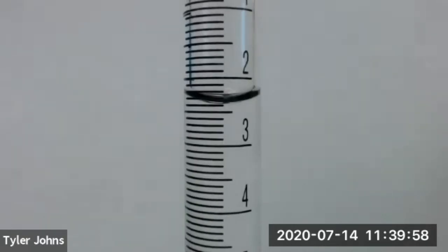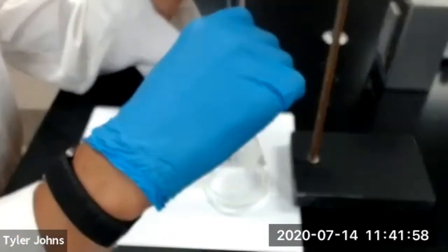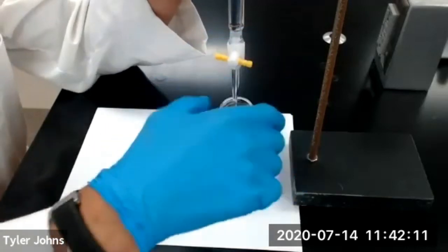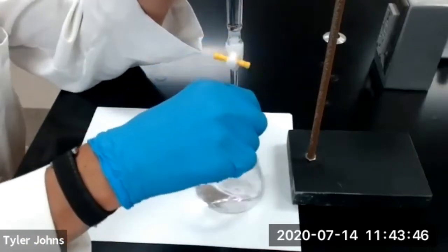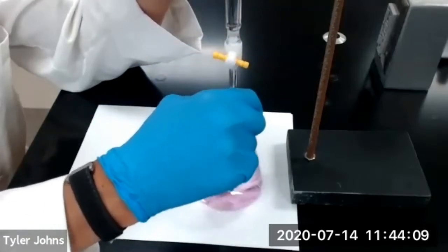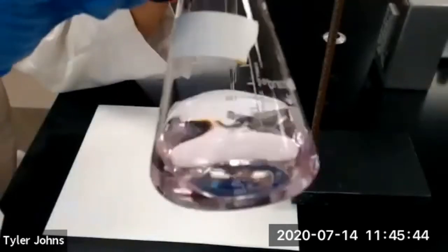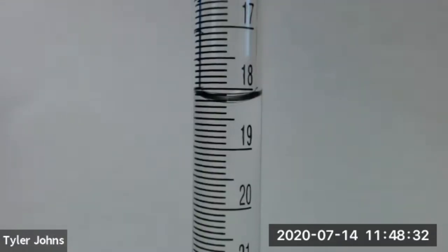This is our initial burette reading for trial number one. We'll now begin titration of trial number one. We've titrated to a persistent faint pink color and have reached the endpoint for trial number one. This is our final burette reading for trial number one.